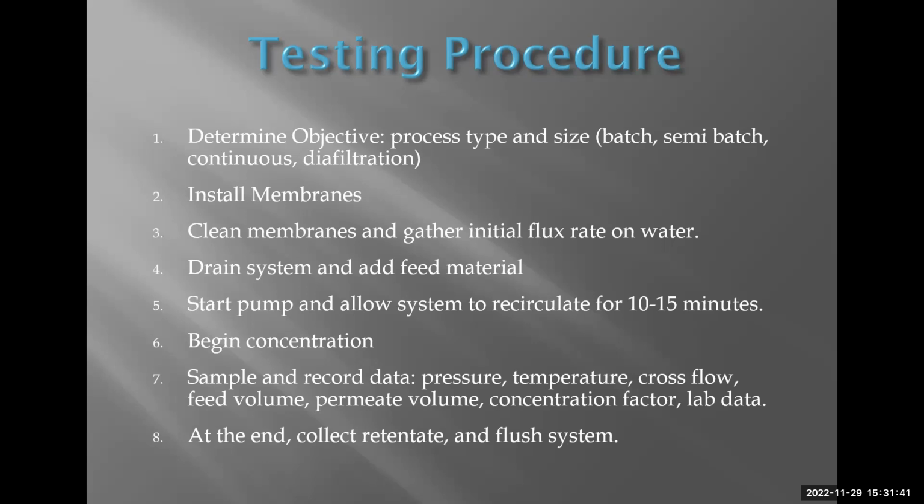Then you'll go ahead and drain the system and add your feed material and then start your pump, but you're going to want to start it slowly so that way you don't get a big water hammer or anything like that into your membranes. And then allow the system to recirculate with the retentate and permeate lines back to the feed tank for 10 to 15 minutes.